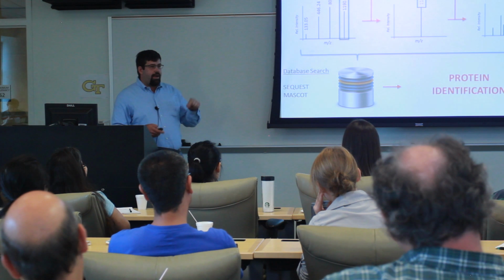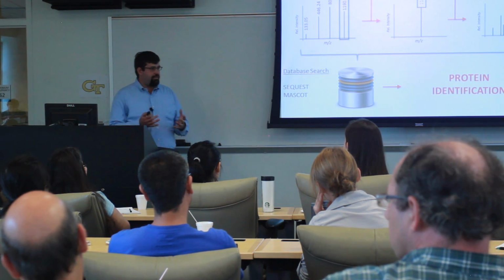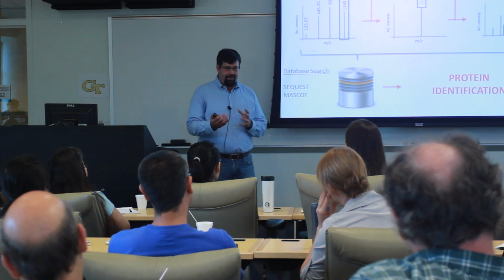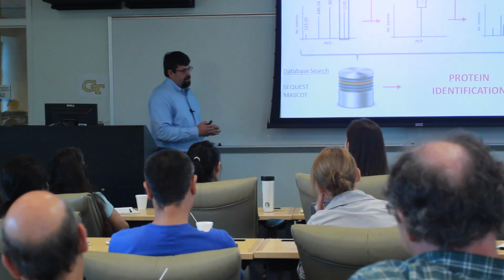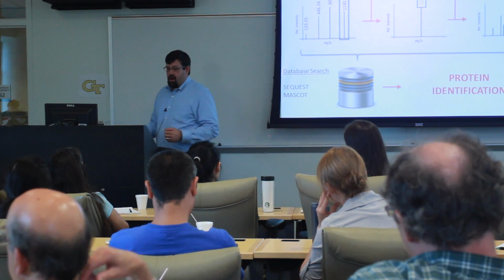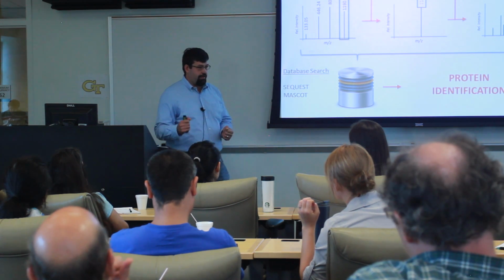We can also do this by LCMS. You recall Facundo mentioned in electrospray, we often couple liquid chromatography directly to the mass spec. The advantage being that we are able to analyze many more proteins, many more peptides automatically without having to manually spot them onto a MALDI target.